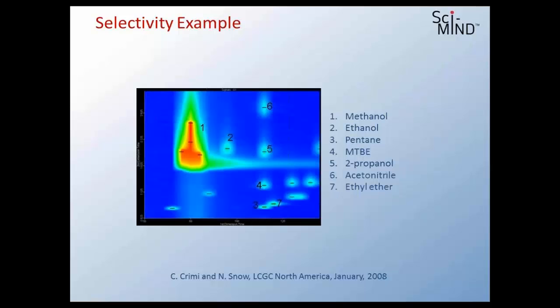Here's just one more selectivity example, a blow up of one of these, and you can actually see there's 4 peaks there all lined up. Those 4 peaks would have been perfectly overlapped or almost perfectly overlapped in just a traditional separation. But to get the selectivity and to get the resolution, we've stepped up the complexity of the instrument by moving to this 2-dimensional separation. And that's one of the challenges that we have. If we're going to buy the higher resolution, we're either going to go slower or we're going to go more complicated. And those are some of the challenges that we have.